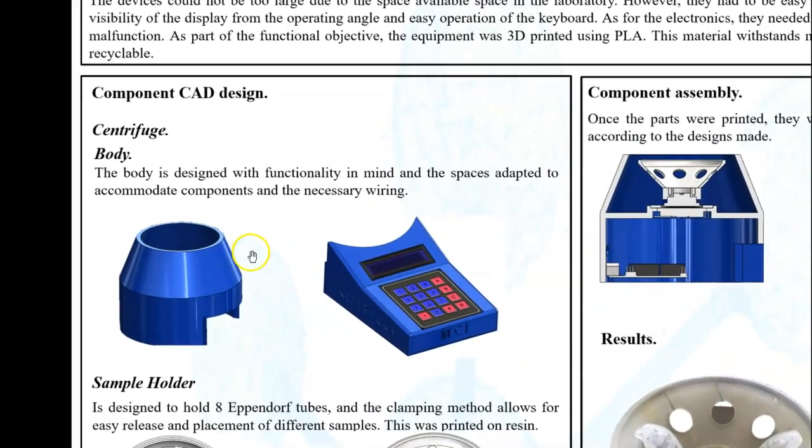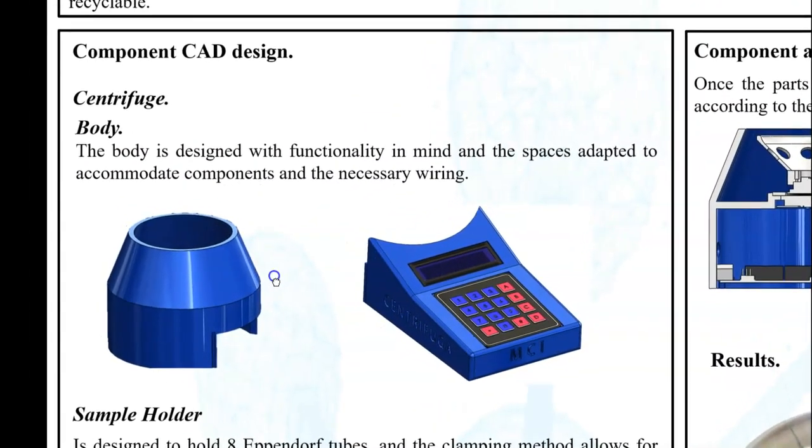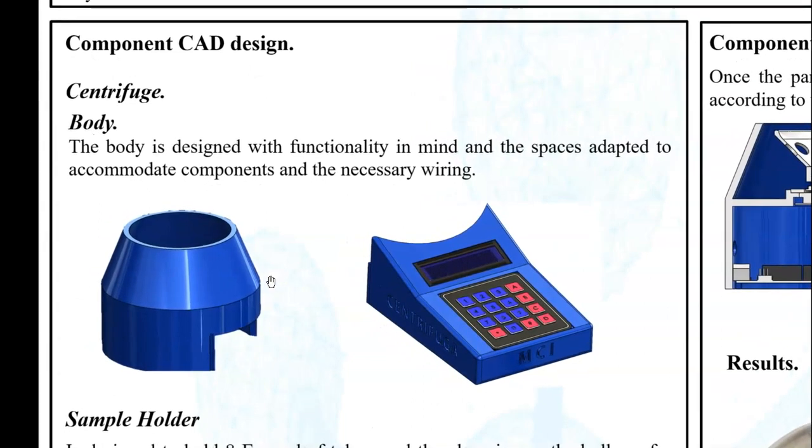Design. CAD design, in addition to 3D printing, is a fundamental part when carrying out this project since, as mentioned, different limitations had to be covered, such as space, weight, final dimensions, and in the case of these devices, the revolutions per minute that both teams would work. 3D printing allowed us to make different designs and change between them. In this way, we have continuous improvement and do not worry about waste, since it is completely recyclable and resistant.